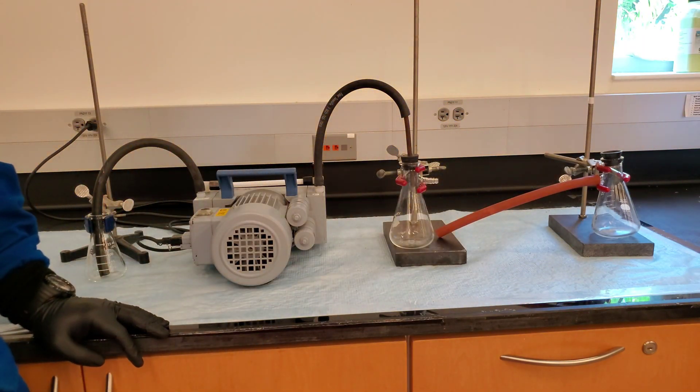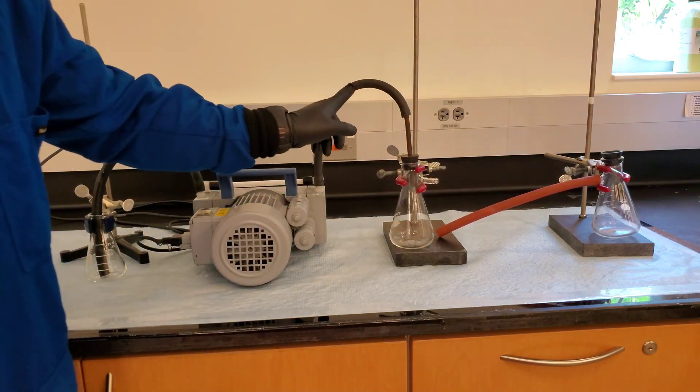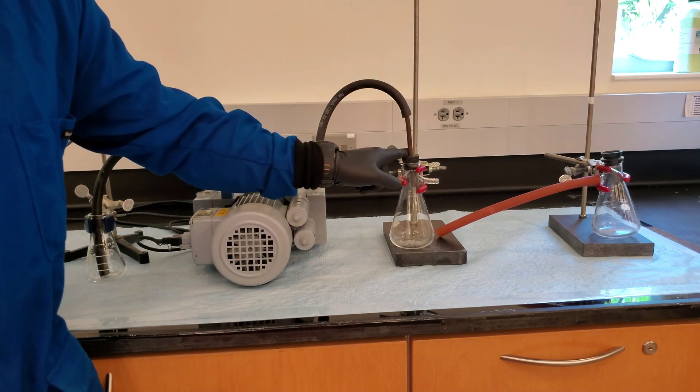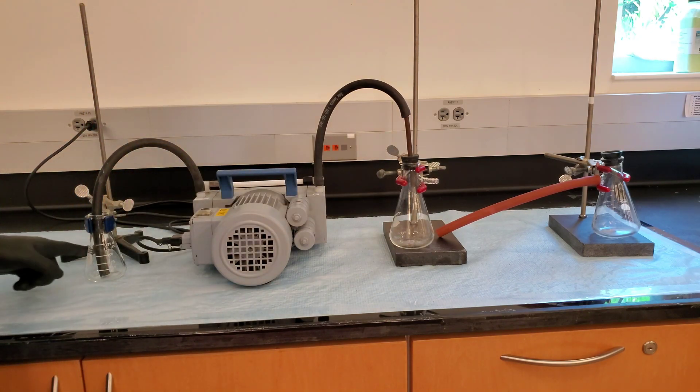Additional materials include three vacuum hoses, one hole stopper with hose outlet, and one beaker or flask.